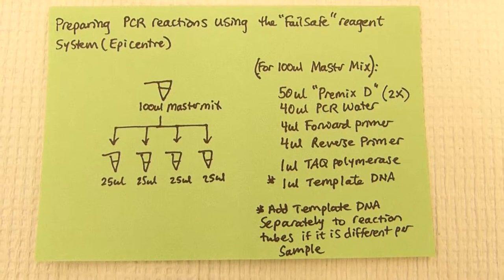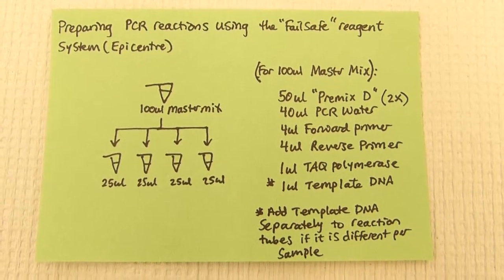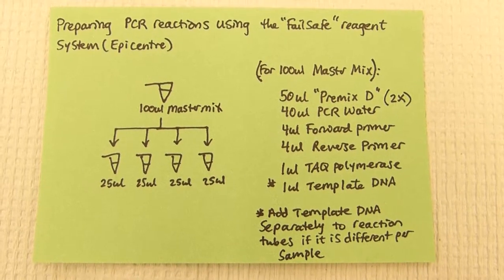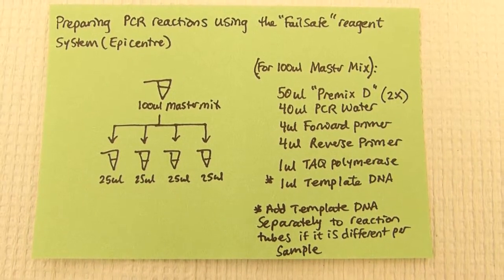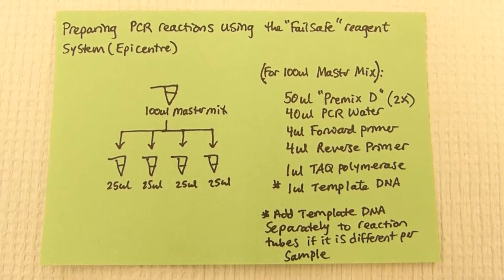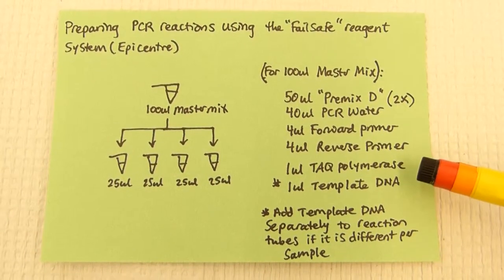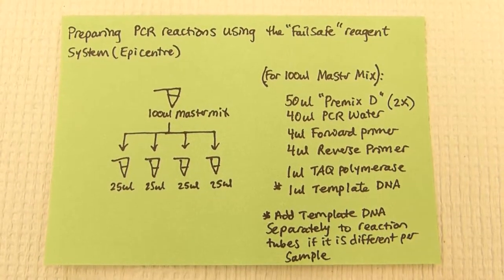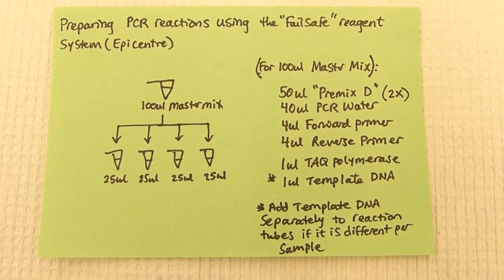Today we are going to set up polymerase chain reactions, or PCR reactions, using the FailSafe reagent system from Epicenter. The overview of this process is we will first make a master mix, and then we can divide this master mix into separate reactions. Making the master mix is easier because in many cases we'll be pipetting very small amounts of reagents — for instance, one microliter of Taq polymerase — and it's more accurate if we can make a larger amount to separate into smaller reactions.